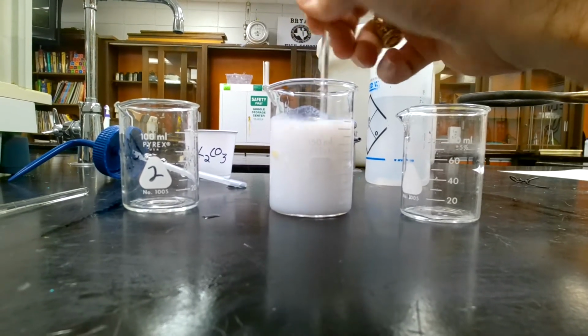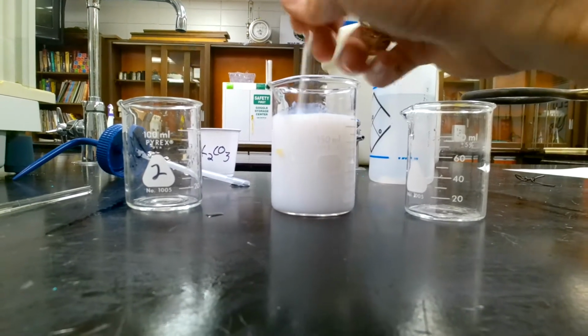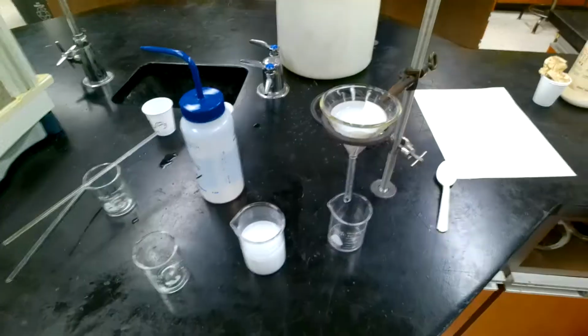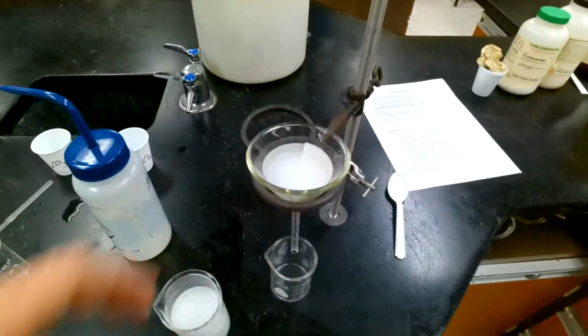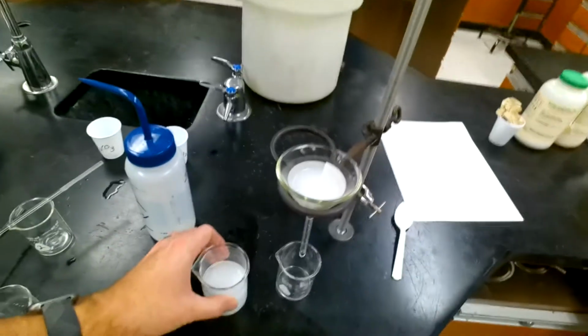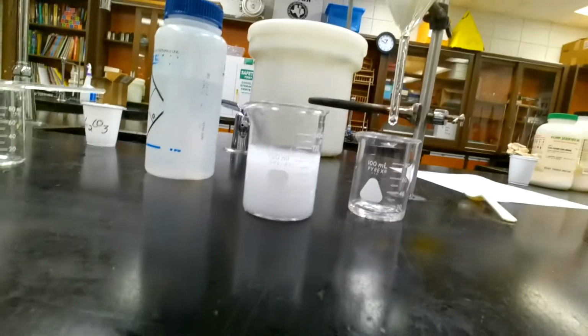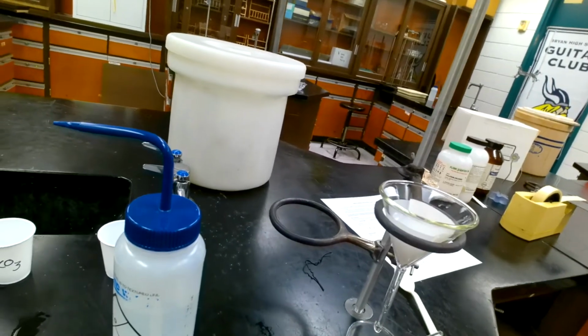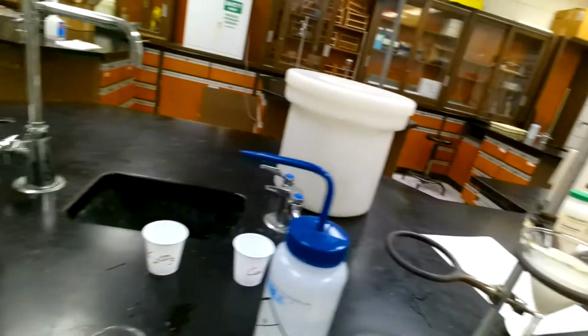I'll spare you all of the details of me stirring and filtering, so see you in a minute. Okay, and we're back. I've started to filter this, and another oversight of putting too much water in here is it's going to take forever for it to filter. So I'll be plugging at this all day, but let me just show you the correct way that we should pour. Now, let's use a shorter rod here.